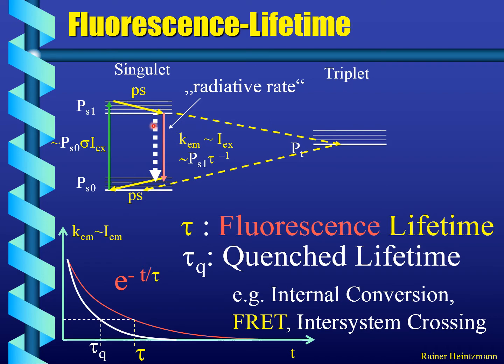And so this additional channel will quench the overall fluorescence lifetime. So tau refers basically to the combined rates here as fluorescence lifetime, whereas the red arrow refers only to the radiative rate as such, which would then be something that you can compute from pure physics reasoning, and which is also interesting.